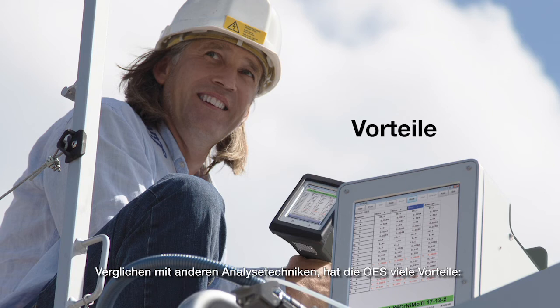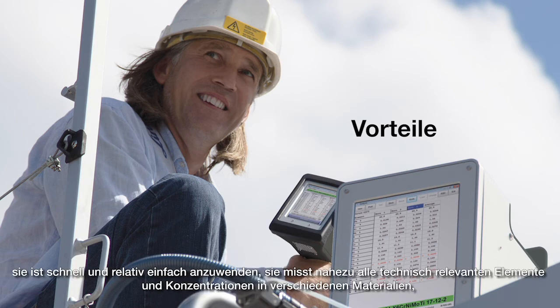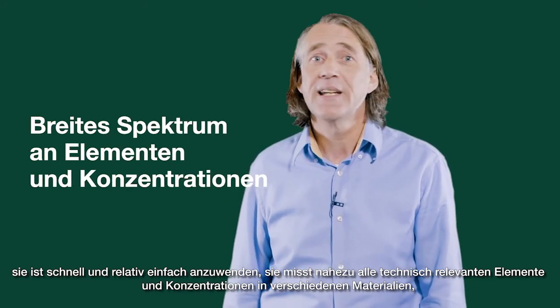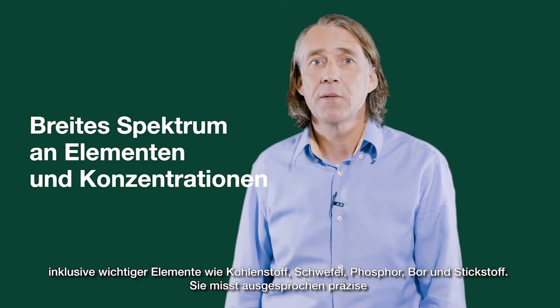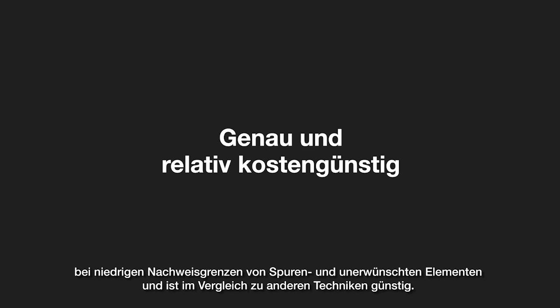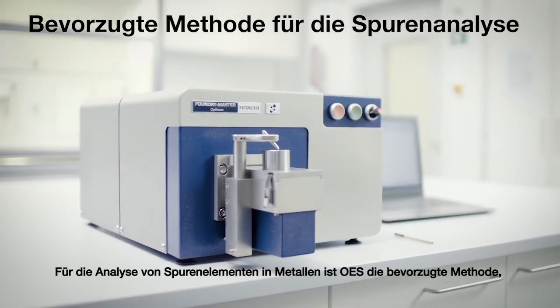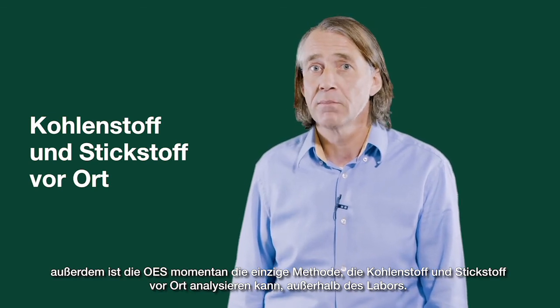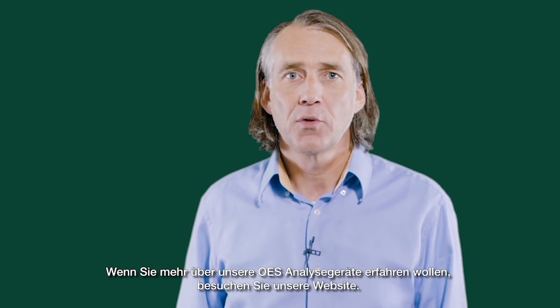Compared to other analytical techniques, OES has many advantages. It's fast and relatively easy to use. It measures a wide range of elements and concentrations in many different types of materials, including important elements such as carbon, sulfur, phosphorus, boron, and nitrogen. It's extremely accurate when measuring low levels of traces and tramp elements, and it's fairly low cost compared to other techniques. For trace analysis of metals, OES is the preferred method. OES is also currently the only method which can analyze carbon and nitrogen on site, out of the laboratory. If you want to find out more about our range of OES analyzers, please visit our website.